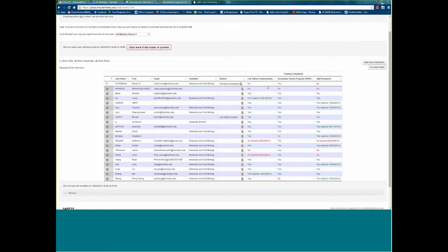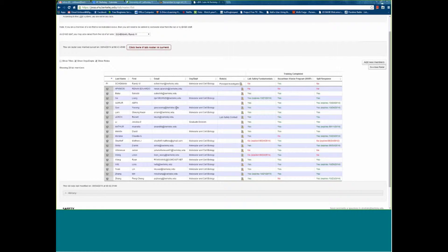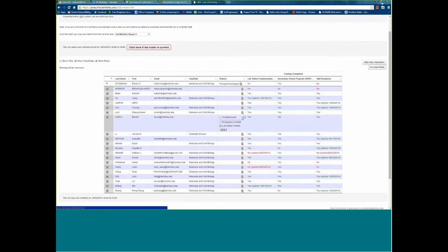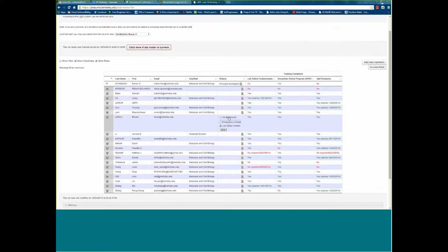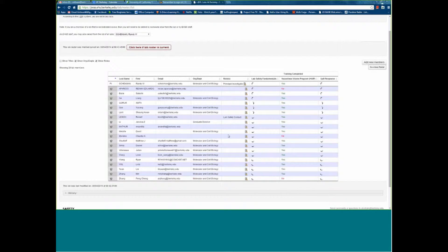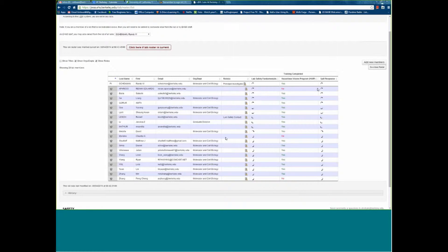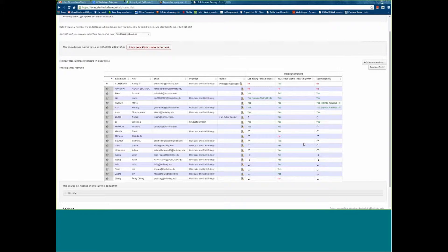We report on these three things, but there are other reporting functions that our inspectors can use to get a handle on things like biosafety or radiation safety or laser safety or other discipline-specific required training. So our people enter the PI, and then once the PI is added, he or she can then add other people to the roster. Once a person is added to the roster, that person can then also add or remove other people to the roster. So your status as a person on the roster allows you to add or remove people. You can also assign a role. We have a no bench work feature, an emergency contact feature or role, and a lab safety contact. Every time there's a change, the query runs again. It's a real-time query to the LMS.